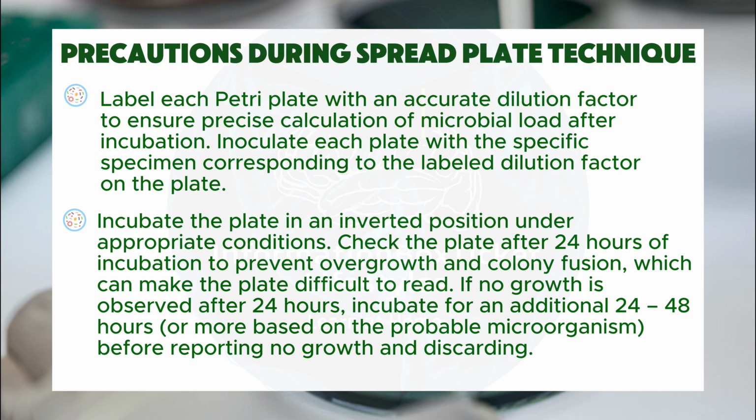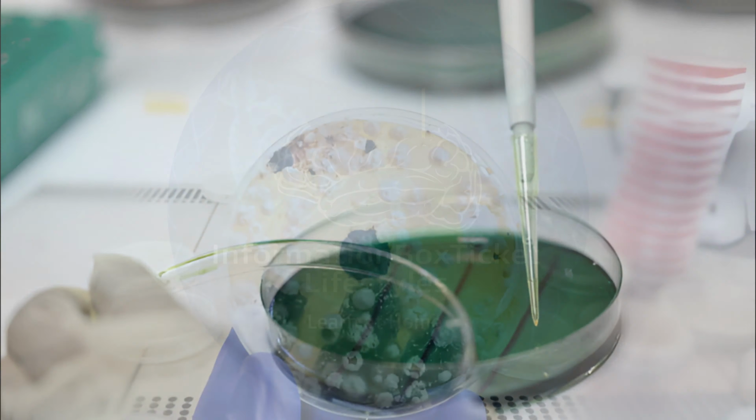Check the plate after 24 hours of incubation to prevent overgrowth and colony fusion, which can make the plate difficult to read. If no growth is observed after 24 hours, incubate for an additional 24-48 hours, or more based on the probable microorganism, before reporting no growth and discarding.